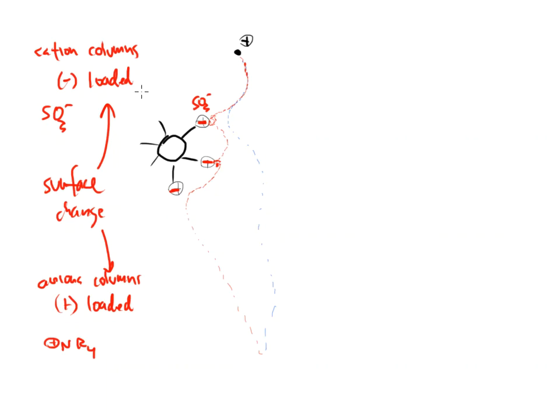So we're discussing columns. And more importantly, we're discussing the stationary phase that's on the inside of these columns, right? So we've talked about the stationary phase, and we've talked about these little prongs that are sticking out that are really functional groups. And the purpose of those prongs or those fingers is to slow down the anions or the cations that are making their way through. All right. So the first thing that I want to say is, how on earth does this interaction really take place? What's going on chemistry-wise? What are the details that are happening on the inside?